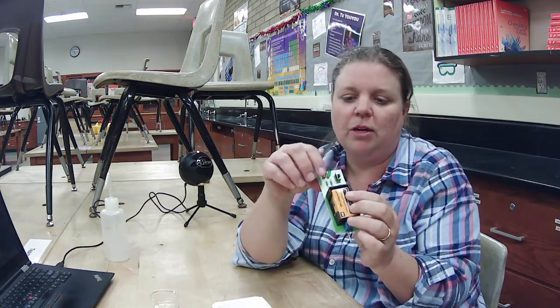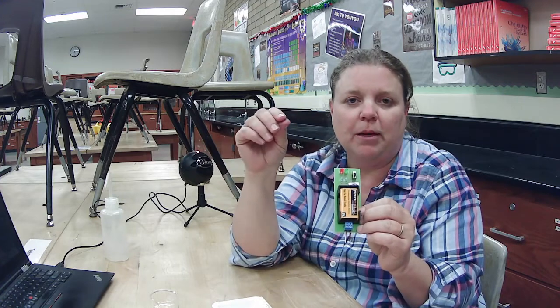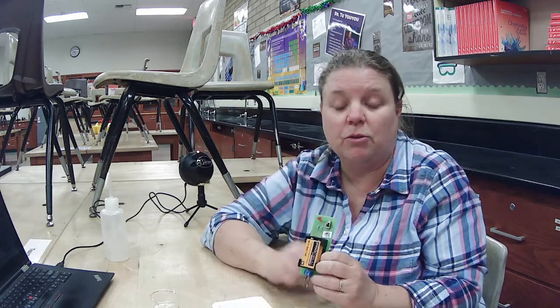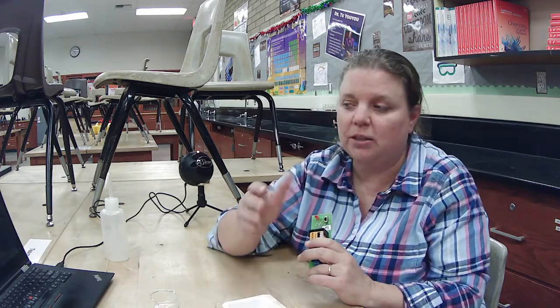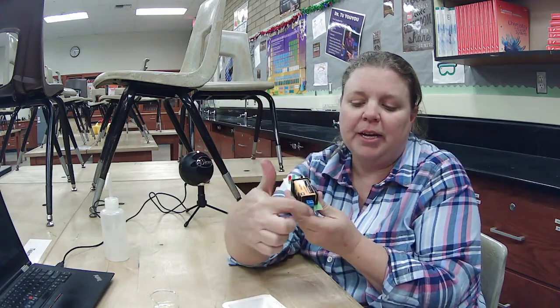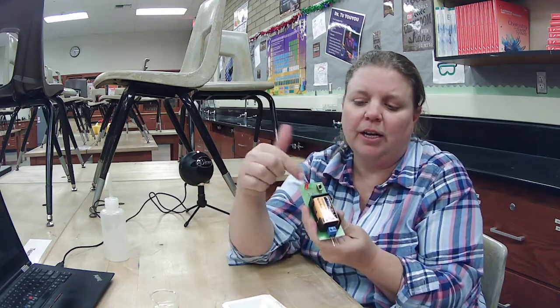This is what we like to call a conductivity tester. When we turn it on and put it in something, this red light will light up. It'll either be very bright for high conductivity, or really dim for low conductivity. If it doesn't light up at all, it has no conductivity. First we're going to test sugar and salt as a solid. Notice it has a battery, and then it has these two prongs. When it conducts electricity, the prongs close the circuit and light up our light.